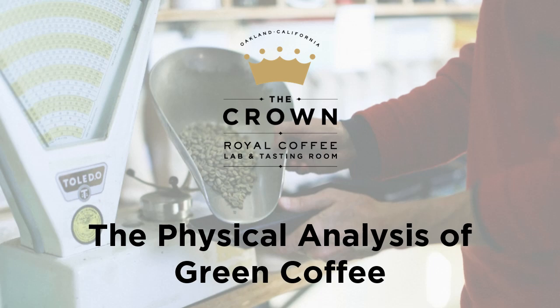The physical analysis of green coffee can be broken down into four basic categories: size, density, water content, and defect count. Each of these metrics can have a bearing on any coffee's sensory quality and trade value. As such, it's worth the time of any roaster, coffee buyer, importer, exporter, processor, and farmer to have at least a cursory understanding of these important measurements, how they can be obtained, what their causes and effects might be, and to what degree they might be improved upon.